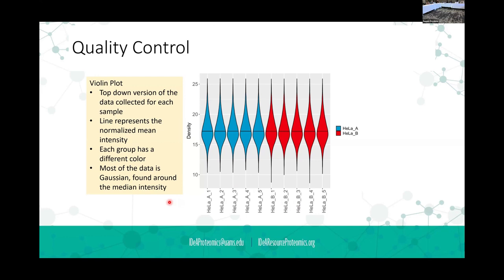Yeah. I have a question. Yes, ma'am. So when we do Western blot, we normally have an internal control, such as GAPDH or alpha tubulin, that is not changing. Yeah. So when we do our final analysis, we use that as a base. So does any proteomics have such a marker? No. So the question is that when you do a Western blot, you always normalize to some sort of housekeeping protein. And do we do that in proteomics? And the short answer is no, we don't do that. Yeah. So what do you normalize to?